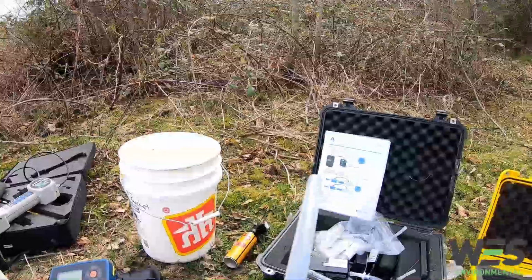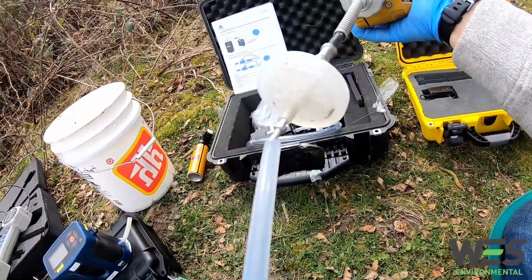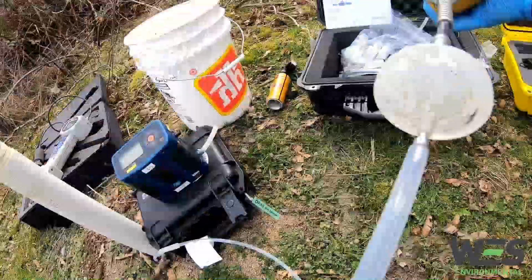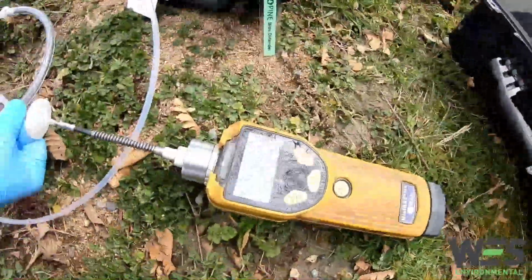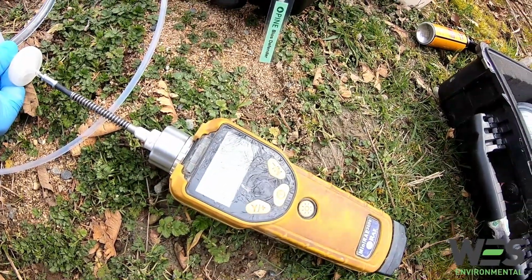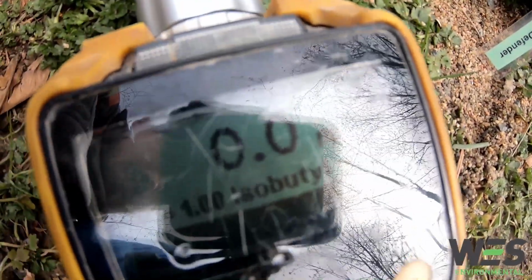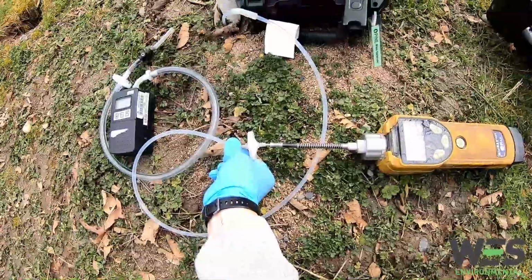What you would do is you take the end of this tubing and then you would stick the end of the VOC meter inside. I'm just gonna hold that there. And then I'm looking at the Mini RAE display here to see if it jumps at all. It's just 0.0. So initial VOC reading is nil.